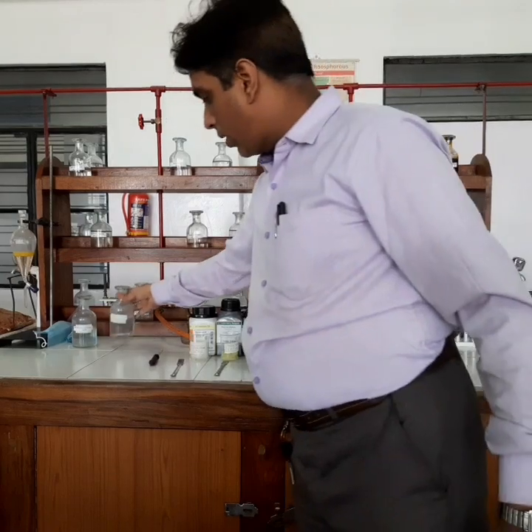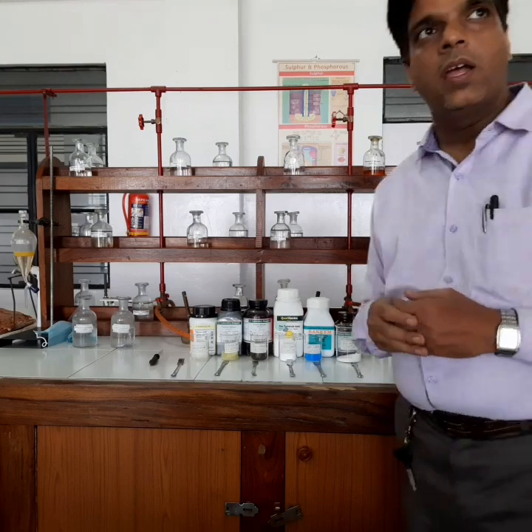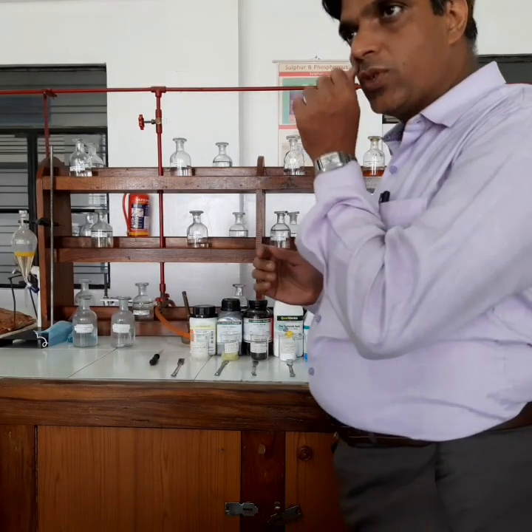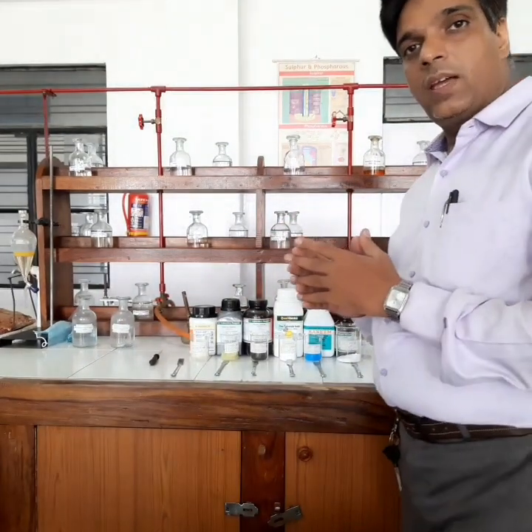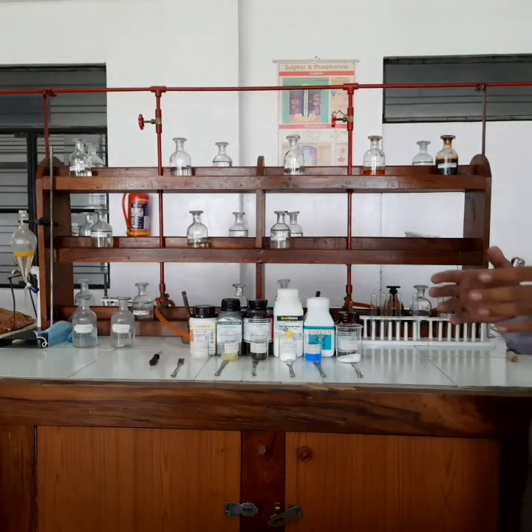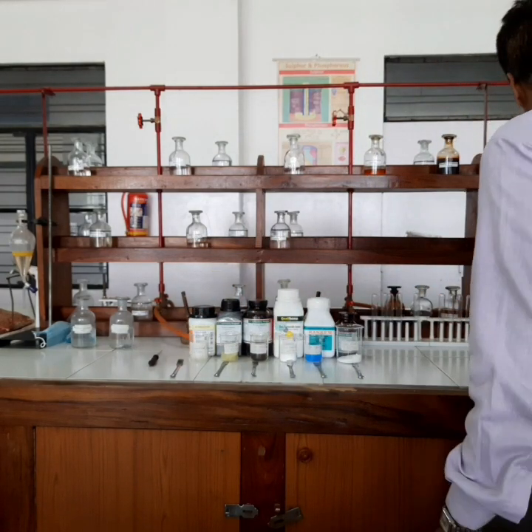So first of all, we are going to add these reagents in limited quantity. So their precipitates of hydroxide will be formed, and then we will check the solubility in excess. First of all, we are going to add NaOH or NH4OH in limited quantity. A precipitate of hydroxide will be formed of a particular color, and then on adding these reagents in excess, we will see whether these precipitates of hydroxide are becoming soluble or not. So let's start with that, and we are going to perform these tests.